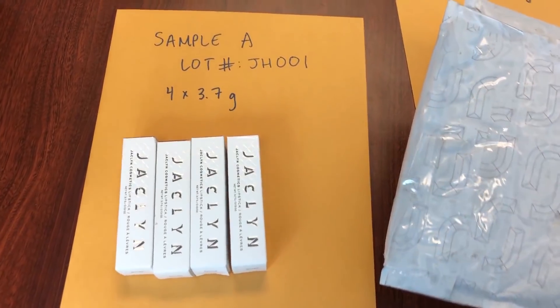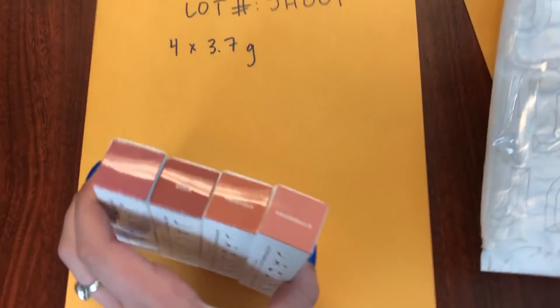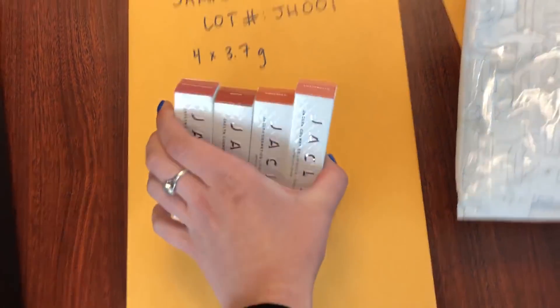As far as the Jaclyn Hill samples, I had two different types. I had one sample made up from lipsticks that had already been opened — those are the two you saw me open on camera in my previous video — and then I had another customer send me their two lipsticks that they had opened but had not used. That is the first sample of the Jaclyn Hill Cosmetics.